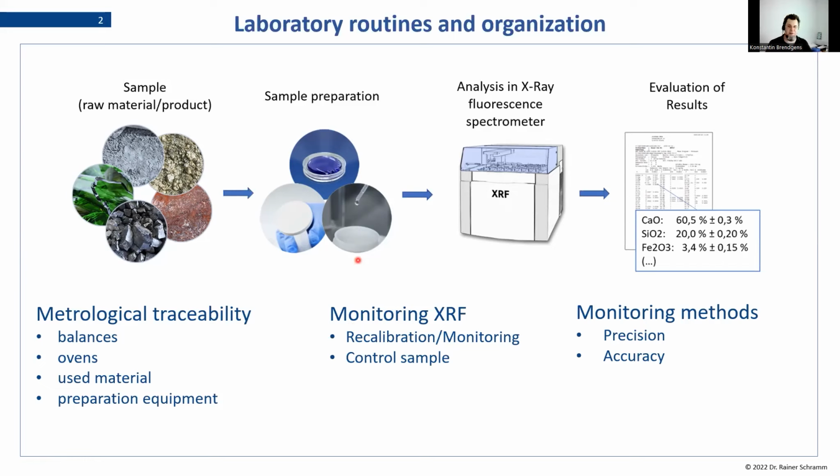In our case, it's always the audits that come regularly with the ISO norm we follow. The main goal of this whole organization and the routines in our laboratory is that we are always ready to answer these critical questions that come from the person auditing us. And it's always basically the question, how can you be sure that the analysis you are doing is correct?